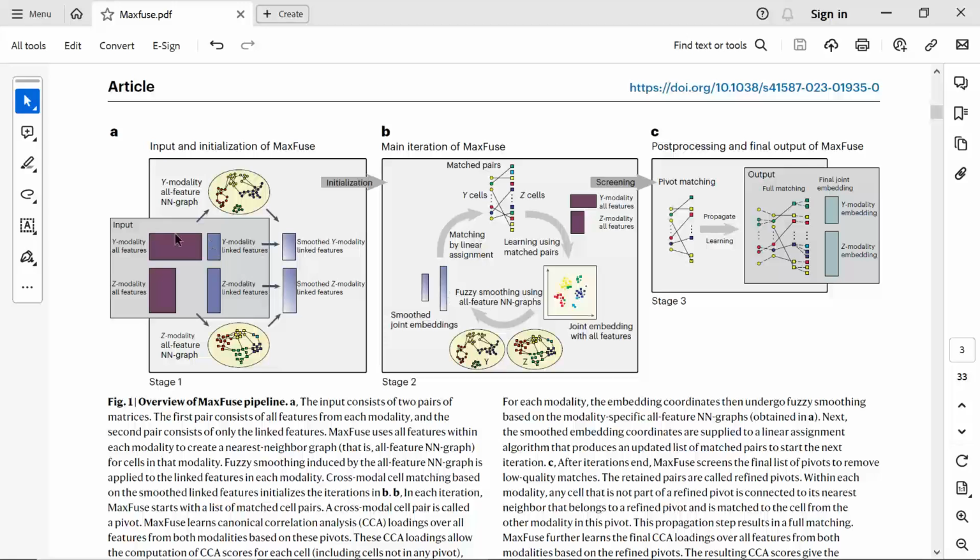I will use the CODEX data and the RNA-seq data to demonstrate the analysis for the 3 stages. But for today's analysis, we are going to pre-process the CODEX data and the RNA-seq data. Basically, today's analysis will be in this box.